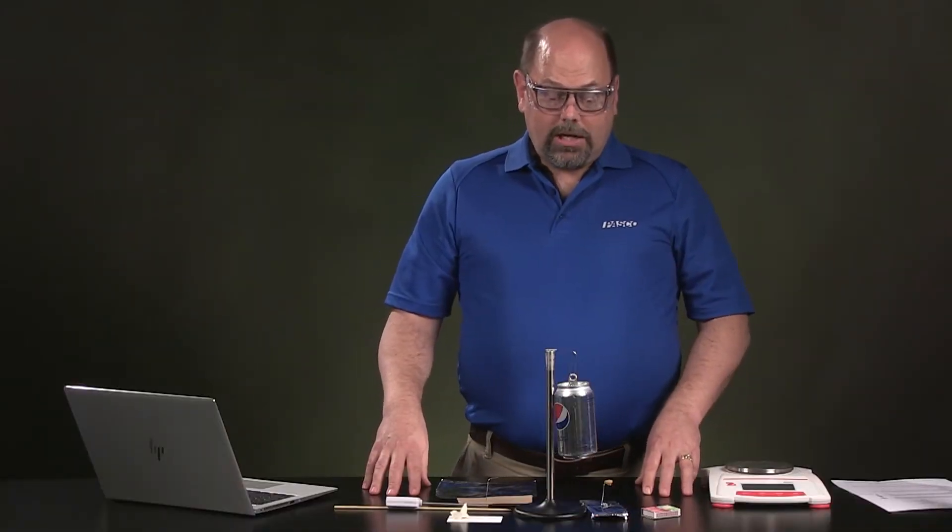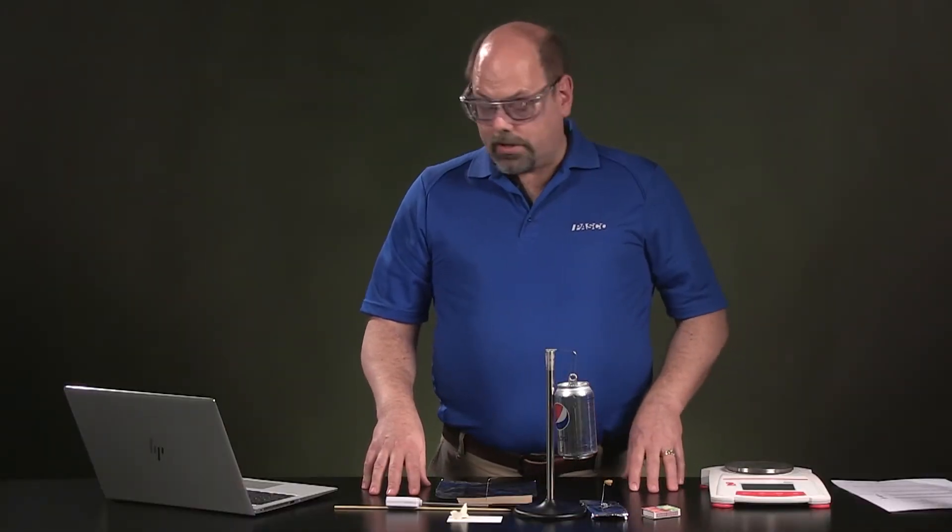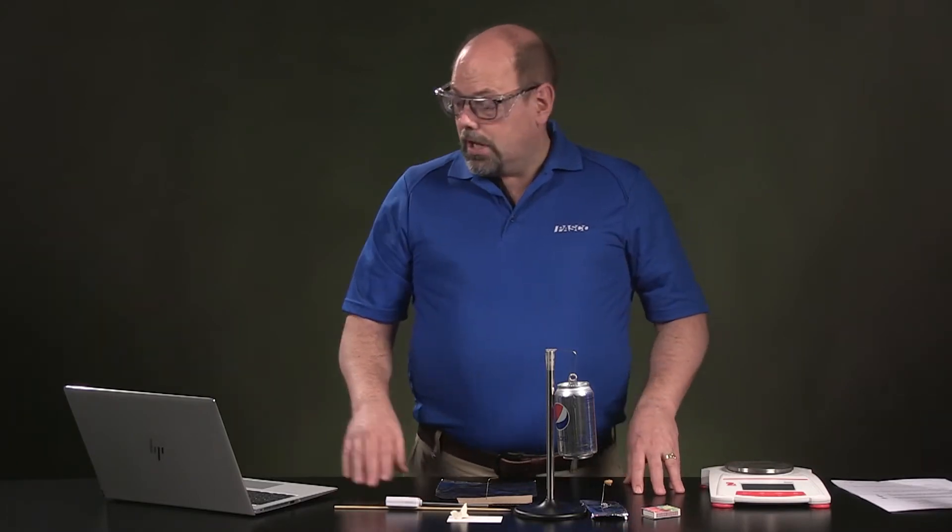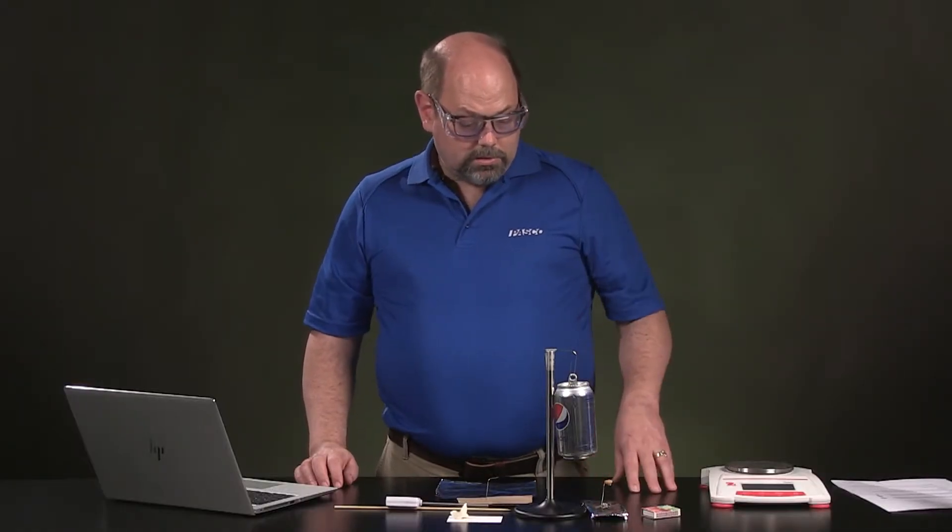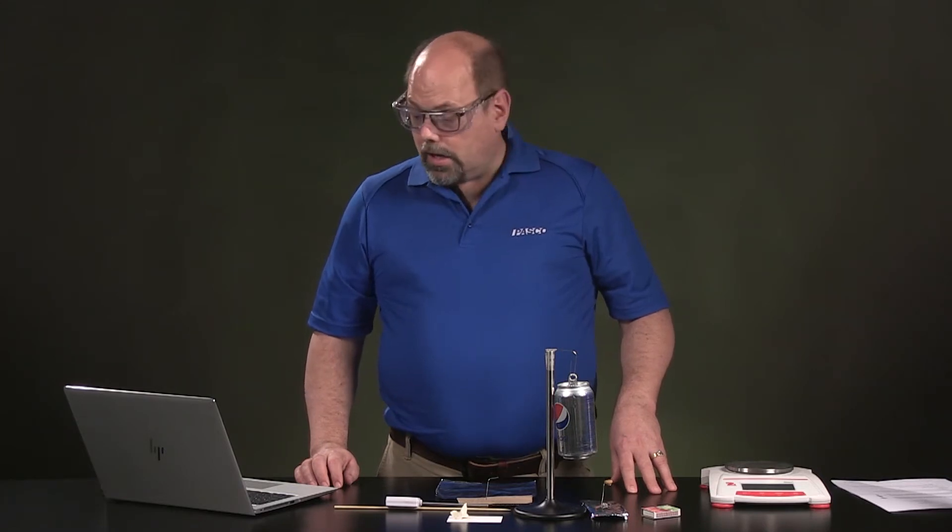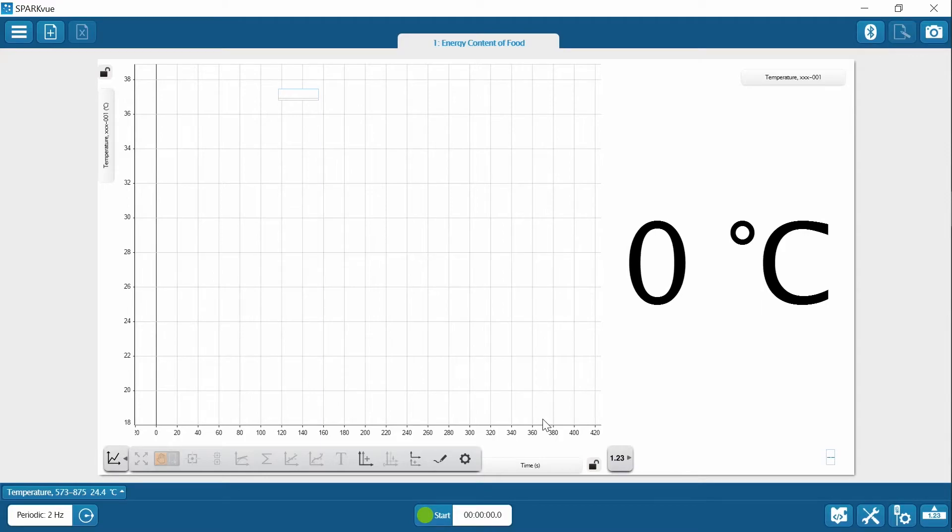Now, to measure the heat change in the water that's going on from the heating from the burning food material, you're going to go over to your computer. And inside of SparkView, you're going to open up the lesson 10 file on energy content of food. When that opens, you're going to get a file that looks like this, which will have a temperature scale across the y-axis to see what temperature the water is that's going on inside of your can. And it's going to have a time graph. You're going to let that time graph roll until either the flame stops when you burn that material up complete, well, as much as you can. And then you'll have a time graph from which you can do the analysis.